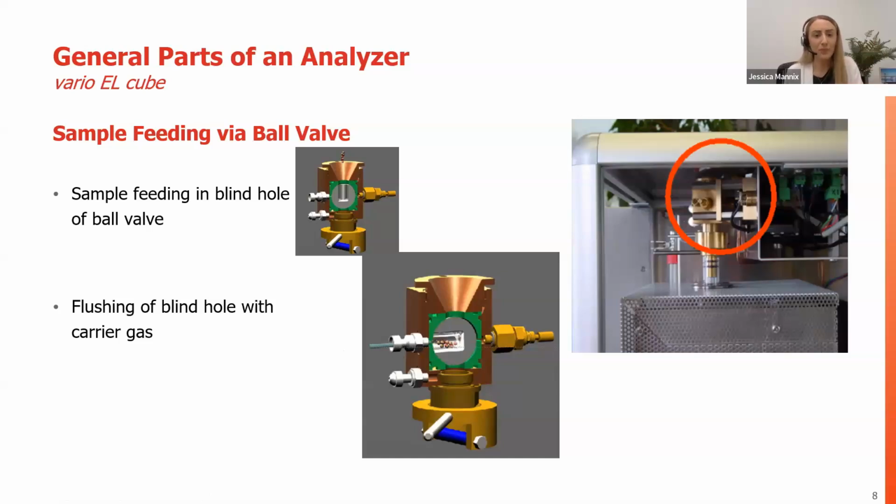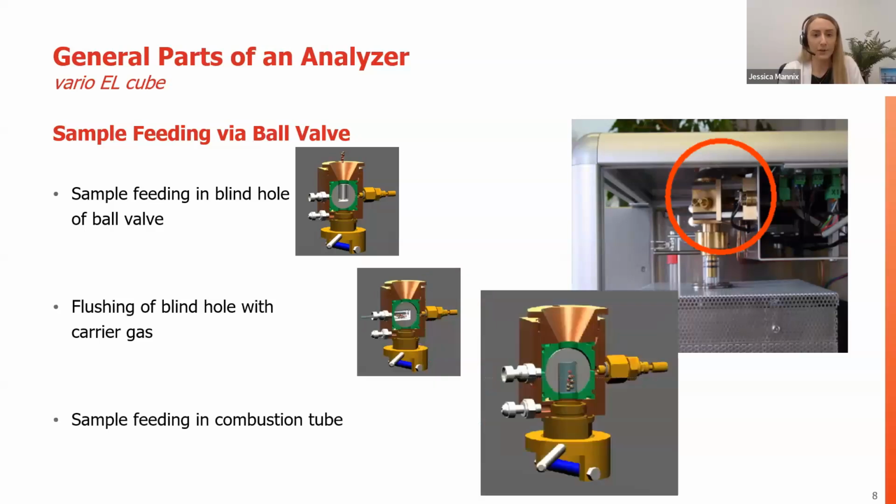on later as well. So the sample cup is sitting upwards, our sample falls in, we turn 90 degrees where we flush with this carrier gas for blank-free sample introduction, finally turning 180 degrees for the sample to actually enter the combustion tube.